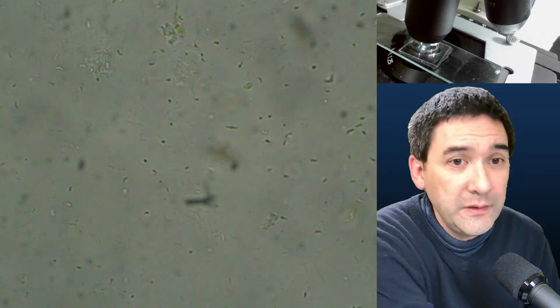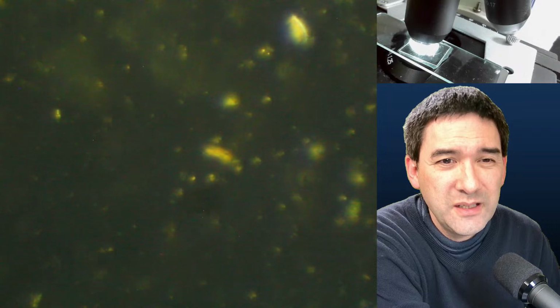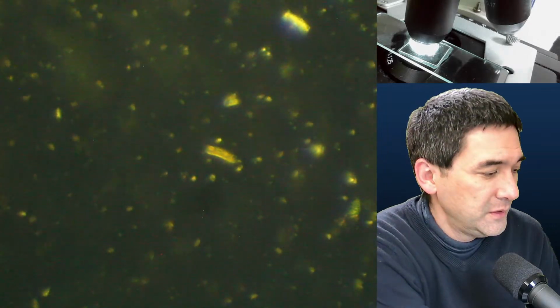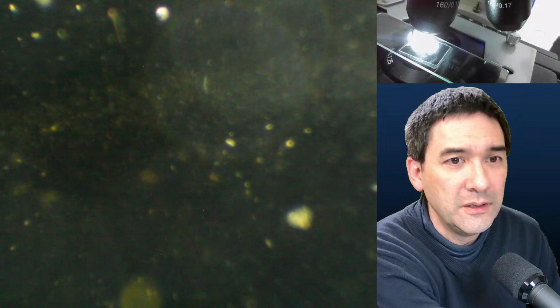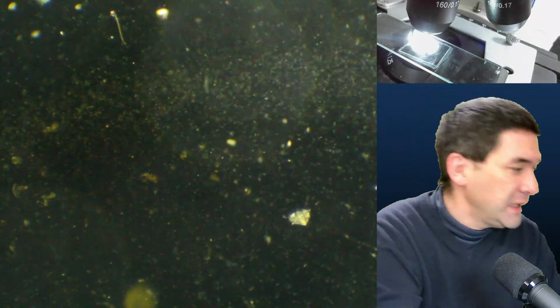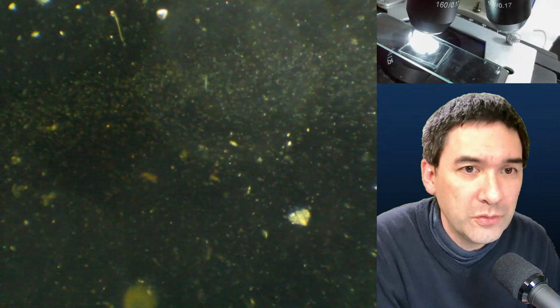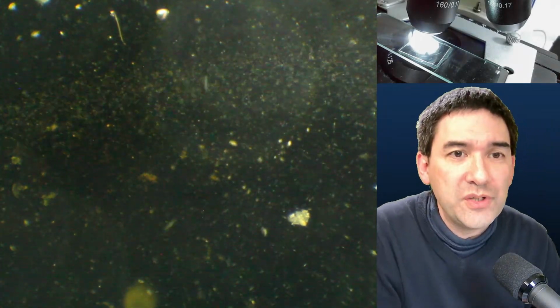And in dark field, again, let's do it like this. You have to open the condenser again. What time is it? Ooh, it's already slowly time again. And that's how it looks here in dark field. And again, you see it's not quite as clear at a low magnification. That's what we see here. Again, if you look through the microscope, it actually looks pretty good, really. Much better than what you see here on camera.